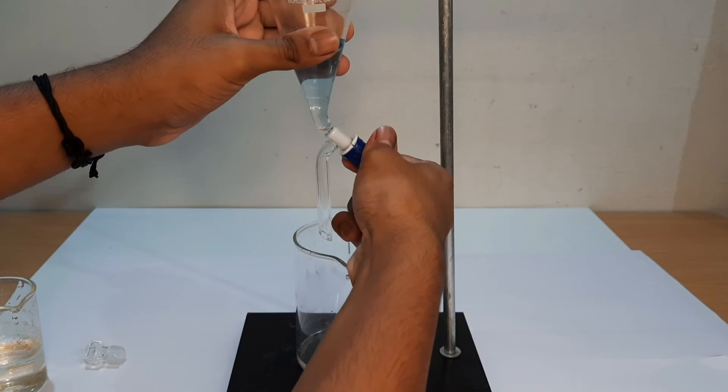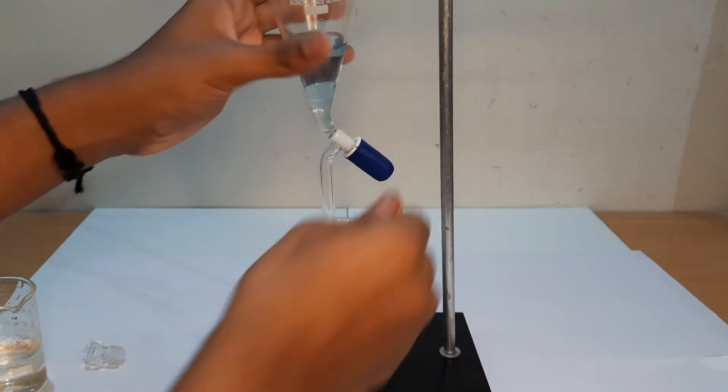Thus the separation of two immiscible liquids by a separating funnel depends on the difference in the densities.